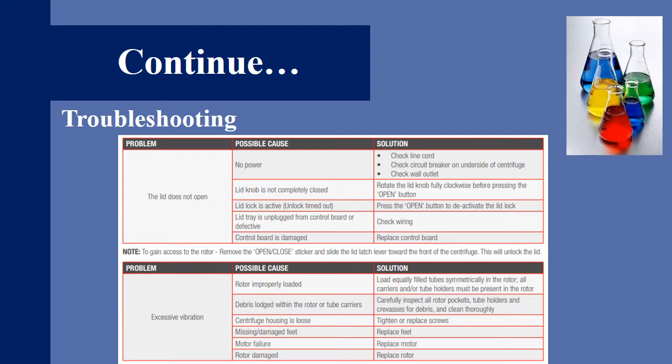If the lid tray is unplugged from the control board or defective, check wiring of the centrifuge rotor. If control board is damaged, replace the control board. Second problem we have faced in the centrifuge is excessive vibration. Excessive vibration can occur due to the rotor being improperly loaded. Load equally filled tubes symmetrically in the rotor. All carriers or the tube holders must be present in the rotor. Centrifuge housing is loose, tighten or replace the screws. Missing or damaged feet, replace the feet of the centrifuge. Motor failure, replace the motor. If the rotor is damaged then replace the rotor.